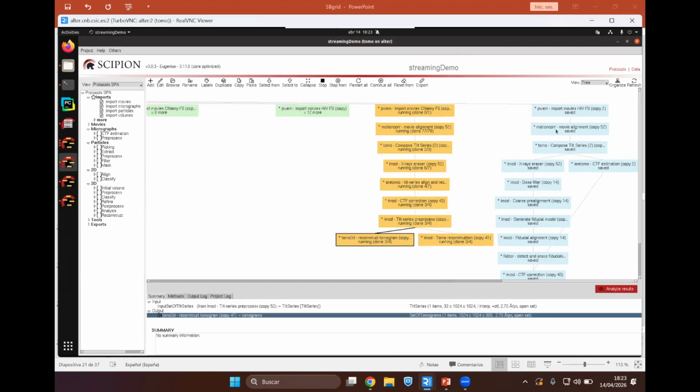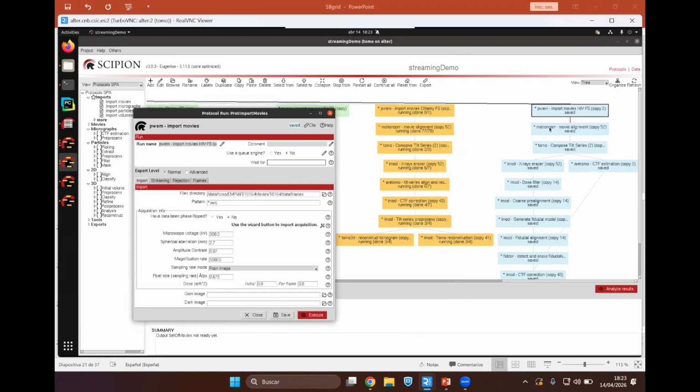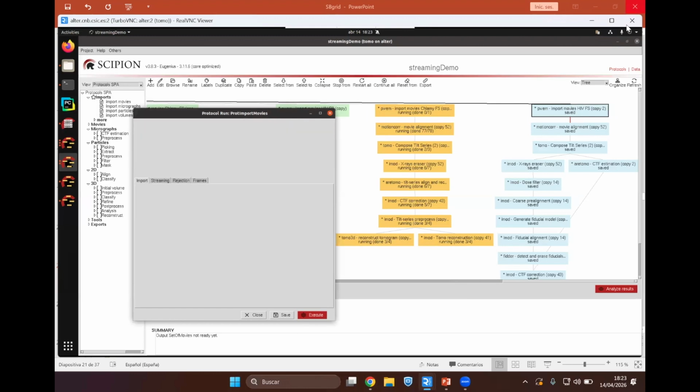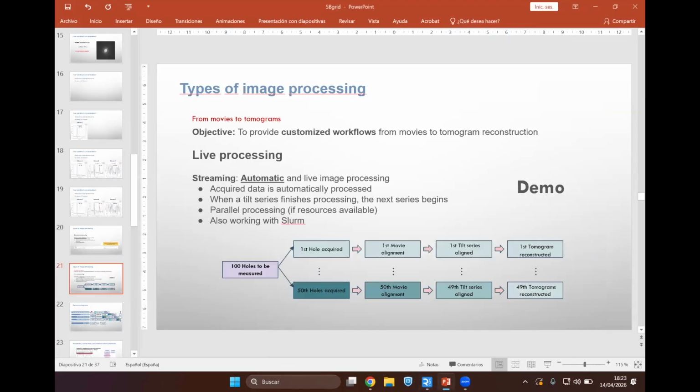So we have here another workflow that involves an HIV sample that I'm going to execute, just to do the same, and we will come back later to see the result. Okay. Did I execute? Yes. And in a remote machine, it is slightly slow.